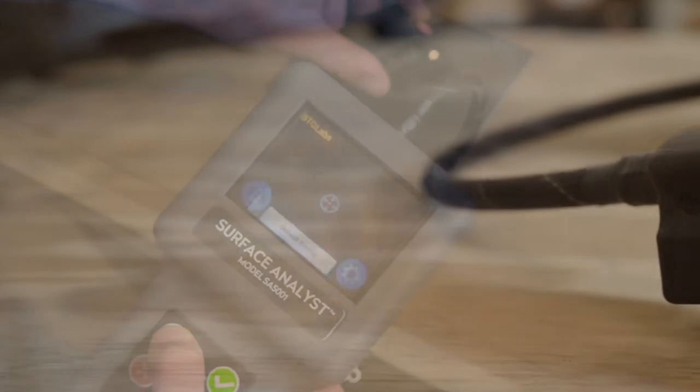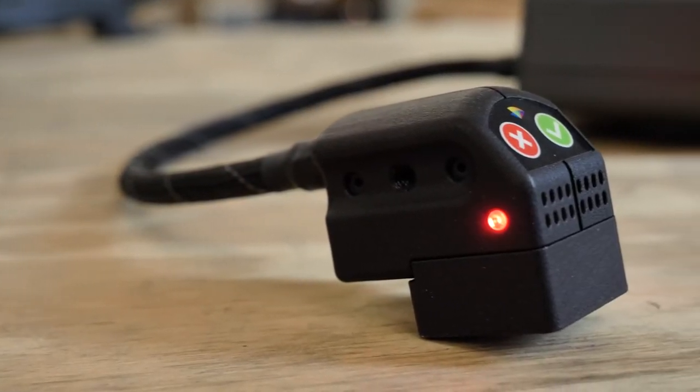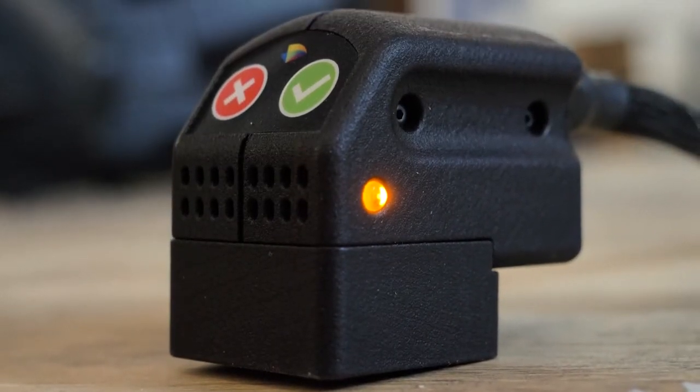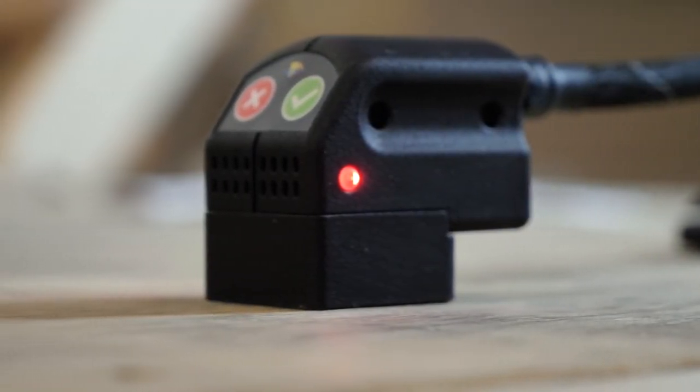The 5001 includes extended controls in the Universal Inspection Head that indicate a pass-fail test from the status lights and audible feedback for an even easier single-handed inspection experience, removing the need to view the device's screen during the test.